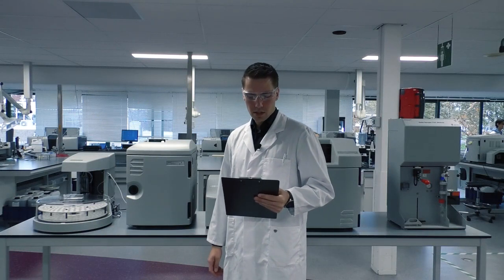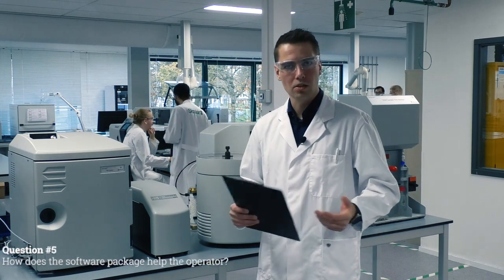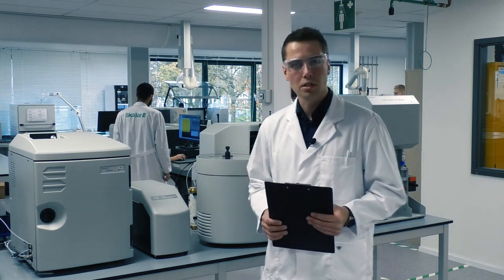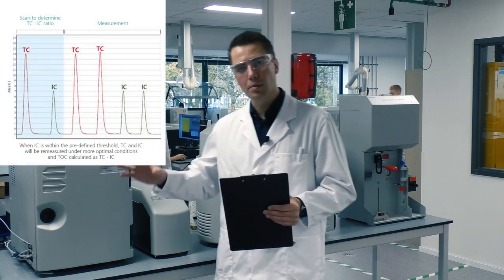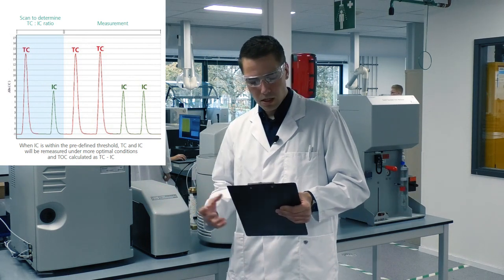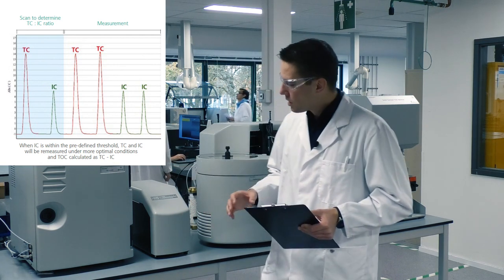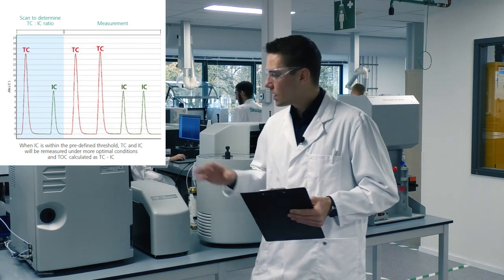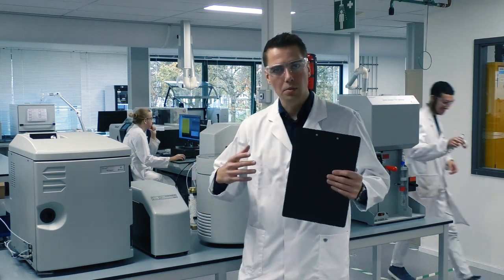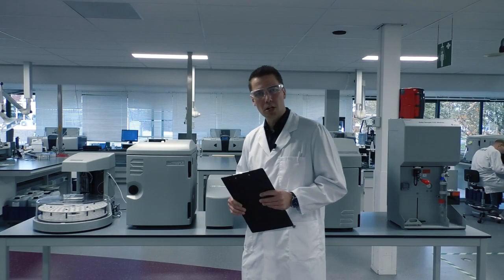Question number 5. How does this software package help the operator? Good question. There are 3 different functions in the software that help the operator to ensure that the results are correct the first time. First one is the smart NPOC. It determines the ratio between IC and TC. For instance, if you have a low IC and a high TC, it automatically selects the TOC by difference. If it has a high IC but a low TC, it does the NPOC method. So what it does in the beginning, it quickly analyzes the ratio between IC and TC and then selects the correct method.